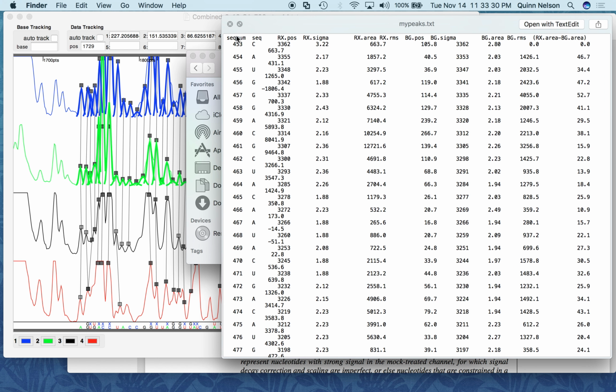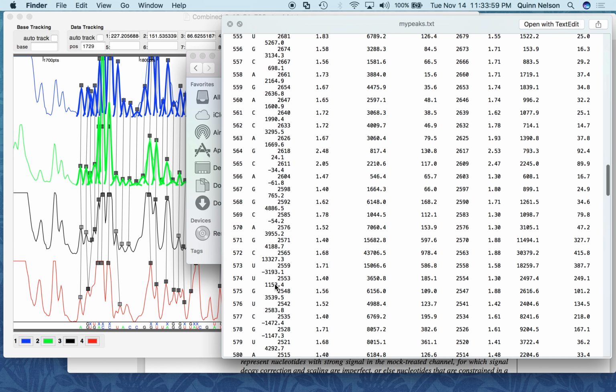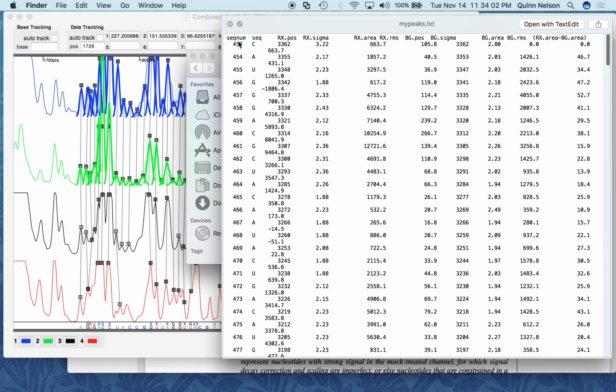Here's what changed. I gave it a window of 450 to 726. The data, the read, was actually longer than I had imagined in the first alignment. The first alignment was 500 to 726. So it produced data, if you remember, all the way up to 726, and I was super jazzed. Why? Because that usually never happens. I was a little naive 2 minutes ago. I shouldn't have been that jazzed because 705 is more understandable. Also, it started at 453, which means that you got a farther back read. That's good.